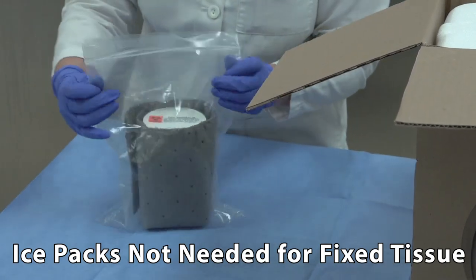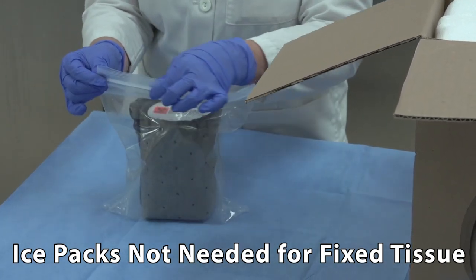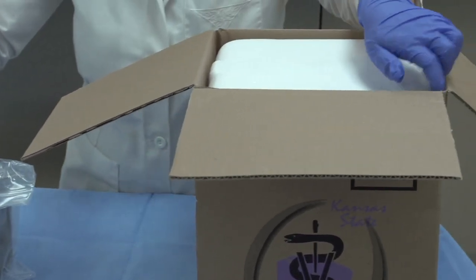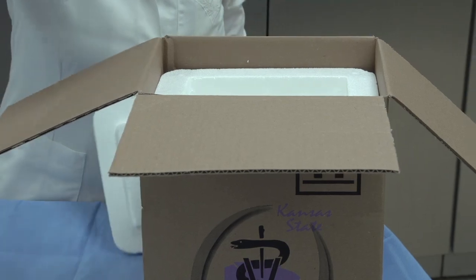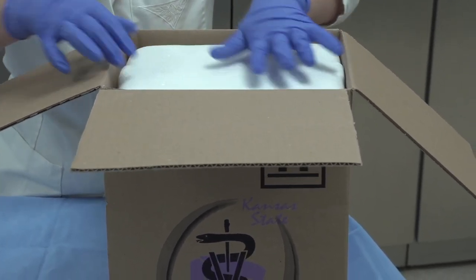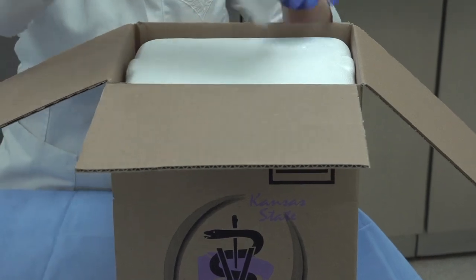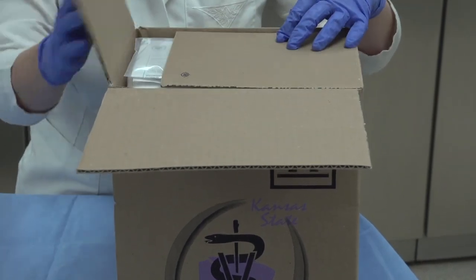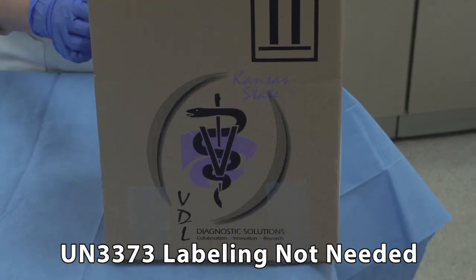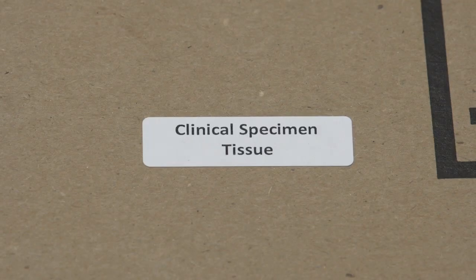There is no need to send fixed tissues on ice packs. In fact, formalin penetrates better at room temperature. Fixed specimens should be protected from freezing. Therefore, in winter, a cooler should be used to protect the sample from extreme cold. Fixed tissues are not considered potentially infectious and do not require UN-3373 labeling. The outer packaging should be labeled clinical specimen.